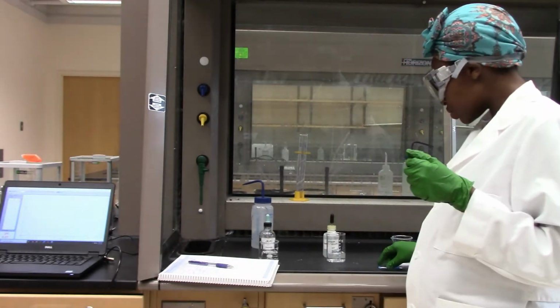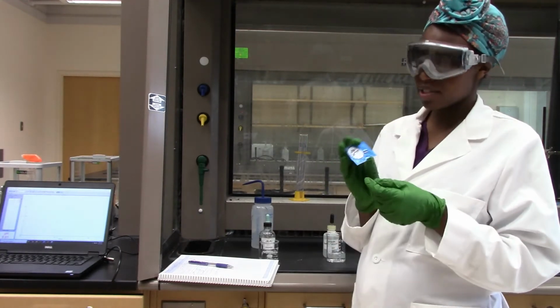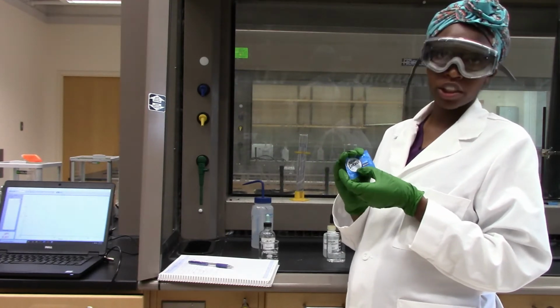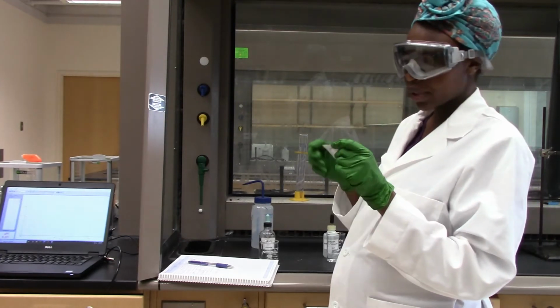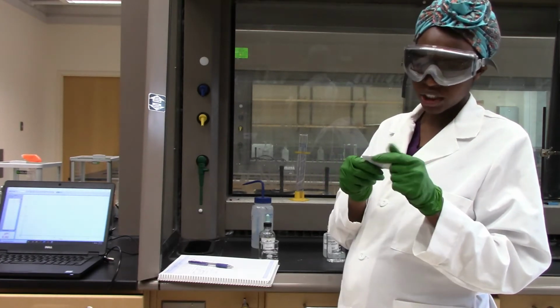So we will use Alka-Seltzer as our buffer to establish our buffer system, and its main ingredient is sodium bicarbonate. So you know that it has an acid or base, and its conjugate acid or base. And that's basically what causes it to resist the change in pH.